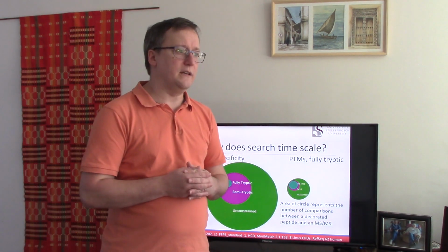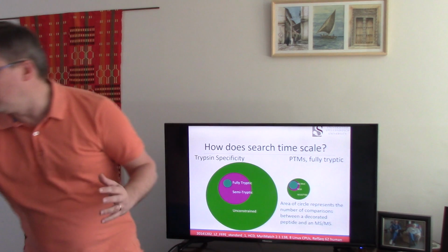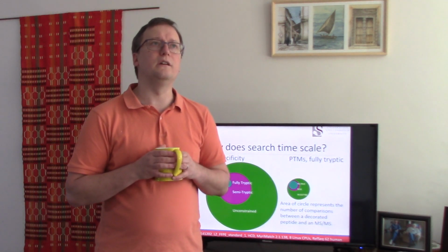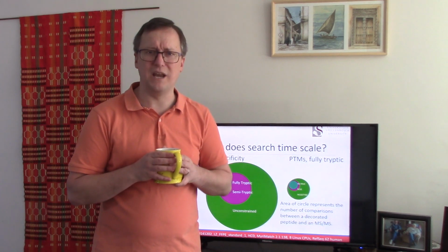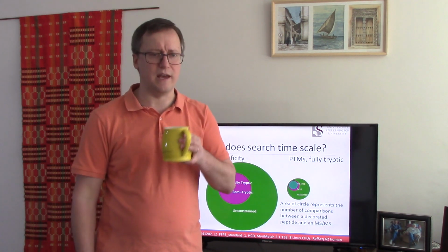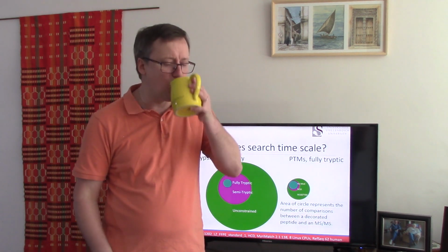Frequently, we find that the major reason people don't do post-translational modification searching is that it takes a long time, and they think to themselves, I don't want to have to deal with how much time is added by that. So I think it's worth quantifying that.